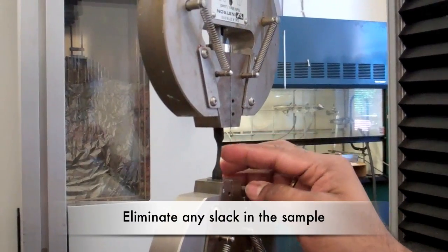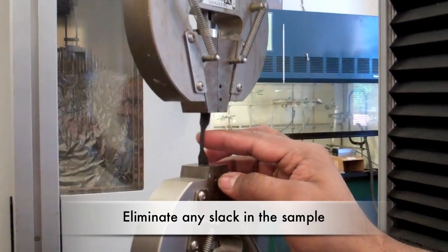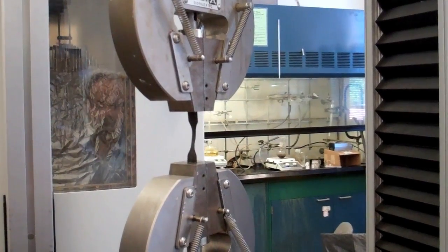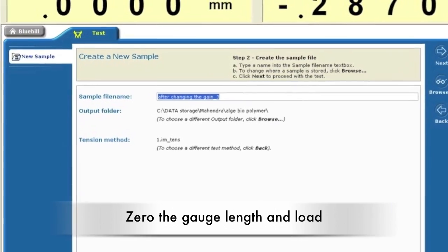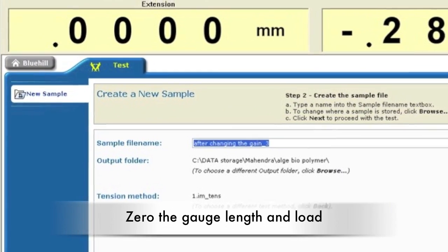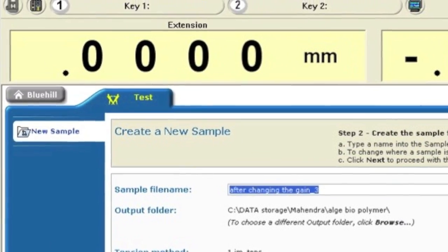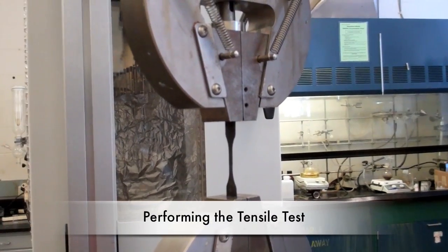The sample may have some slack between the two clamps, so additional distance should be added between the clamps using the controller. Before starting the experiment, zero the gauge length and load if they are not close to zero.